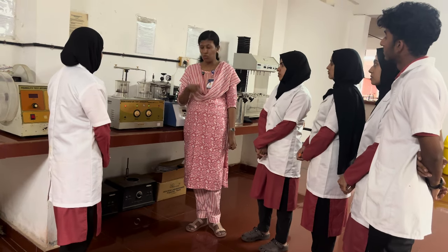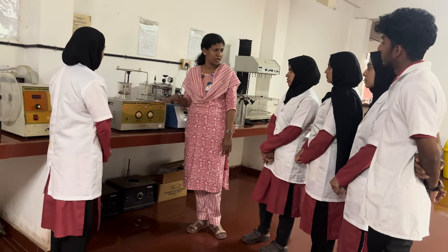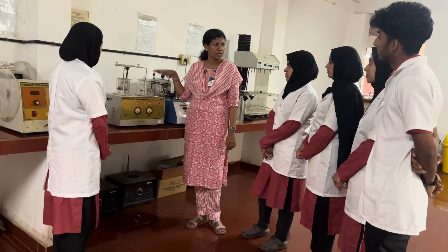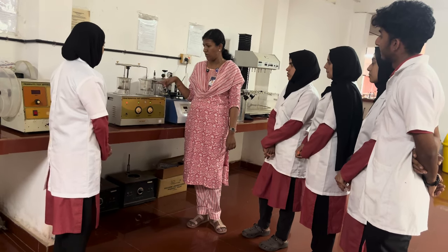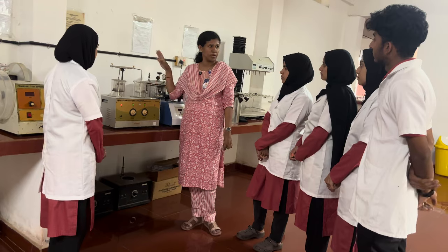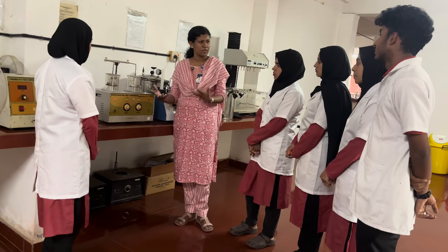To mimic that movement in the stomach, we have this up and down motion, because this is a simulated setup. We are conducting it in the lab, but actually we are mimicking what happens in our stomach. In around 1 minute, it will undergo 28 to 32 cycles of upward and downward movement. Then what do we have to observe? What is our observation?